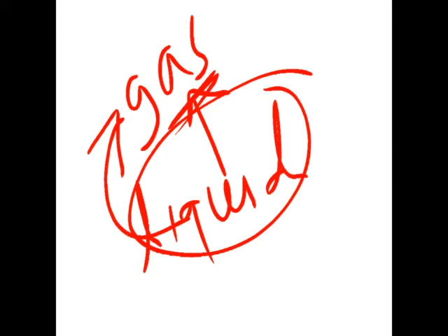Similar can be used in flame photometry also. So here also a flame atomizer is used. This flame atomizer is called aspiration of the sample, that is, they convert the liquid into gases. Okay, so that is the atomizer or the flame atomizer.